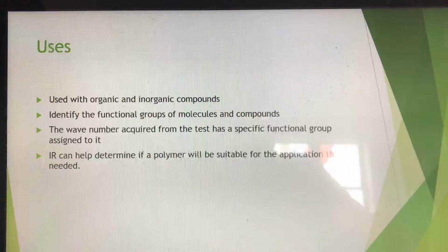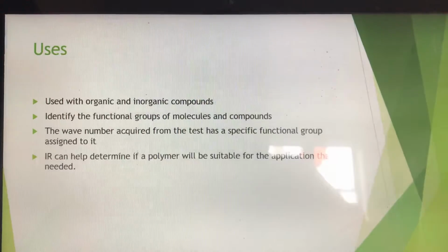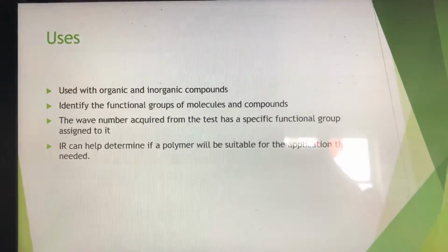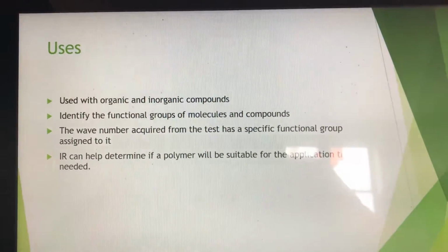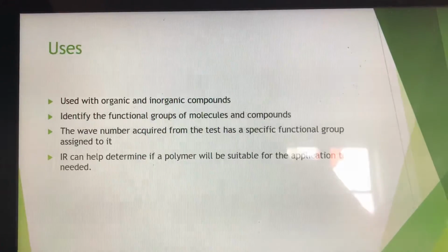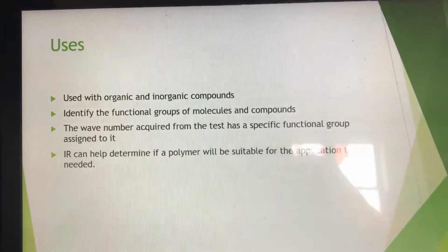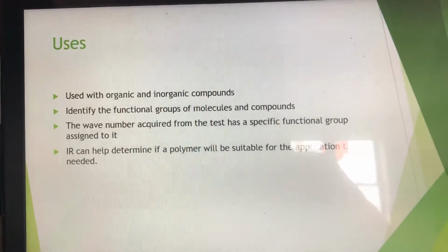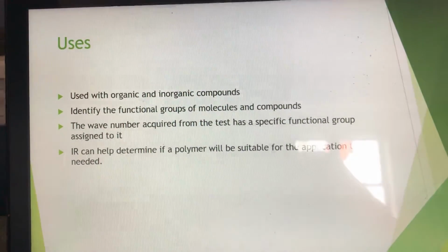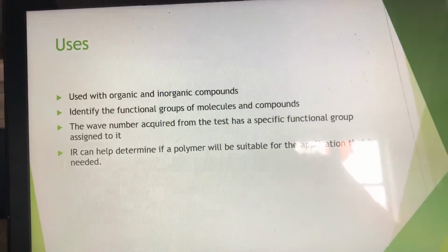It's really used to determine the functional groups of the molecules and compounds, and the main use for it is to determine the applications that are best suitable for your polymer, and if you might need to change your polymer due to the application that it's going to be in, or if that polymer is going to be suitable for the application that you have to use it in. And that is it.